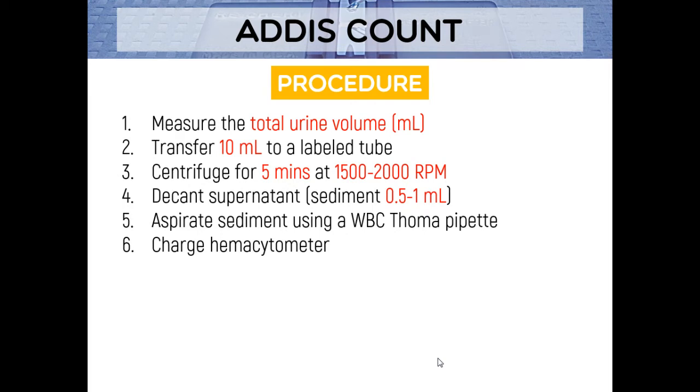Charge sa hema cytometer. Oh my God, as in like, charging sa hema cytometer is one of the mga skills or mga tests na makatest sa imong patients po. Kaya like stressful kayo siya, di ba? Kaya dapat dili siya manglapaw, dapat perfect yun siya at one charge lang. So hassle. Okay, anyway, all right. So again, charge the hema cytometer.